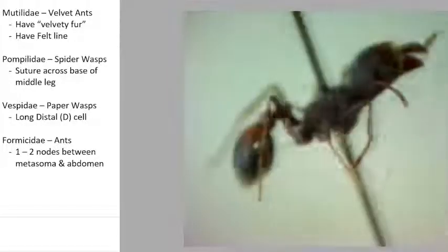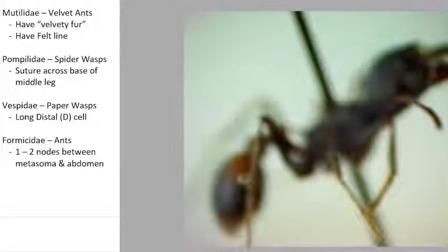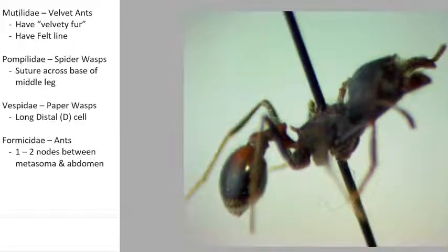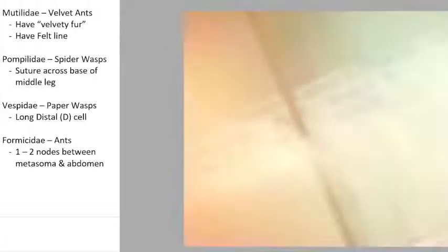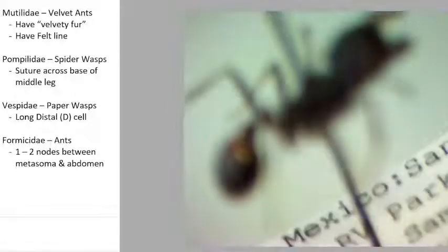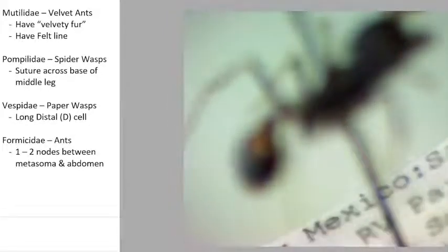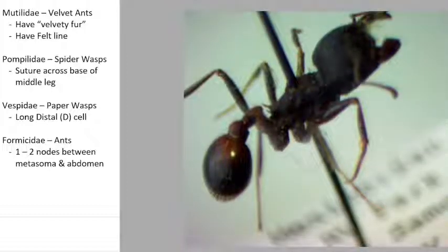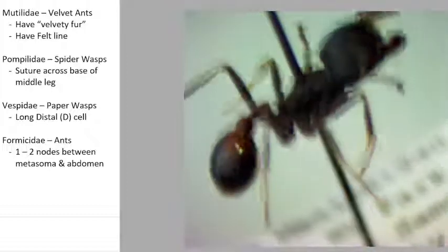And then it's lunchtime. All right, let's see. There we go. All right, sometimes ants get their legs in the way, and I know you're supposed to point ants. So you are supposed to put ants on paper points and not put the pins through them. These were specimens that I pinned a little while ago.